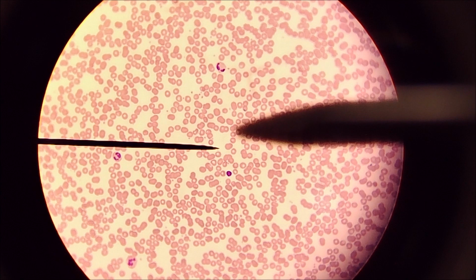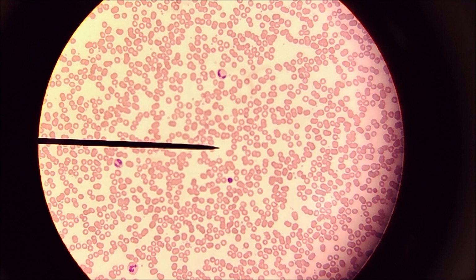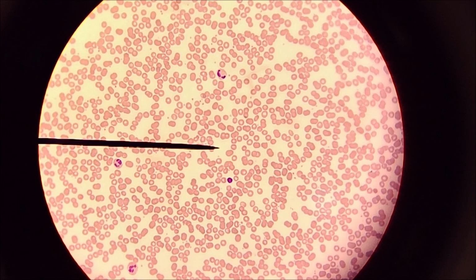So white blood cells are far more rare by comparison. The red blood cells make up the vast majority of your hematocrit. And these are oxygen carriers, obviously, and the white blood cells are defensive ones. And if you notice, these white blood cells all look a little bit different from one another. That's because there's a lot of different types of white blood cells that do different jobs. And that's pretty cool. It's a good view.